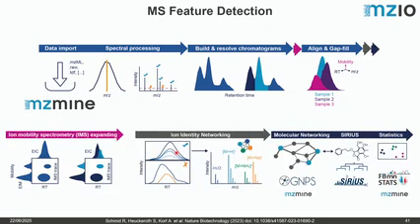And then, of course, later on also add some, for example, ion annotations, molecular networking directly in mzmine or on GNPS. You can exchange the data with Sirius and also do some statistic workflows with the FBMN stats or also in mzmine. And back in the past, when we didn't have the wizard, you would have to do that manually, or like every step individually.